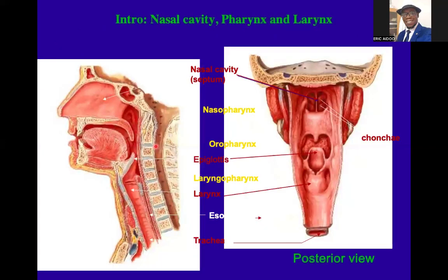As part of the introduction, we are looking at a vertical section through the head and neck, revealing the nasal cavity, pharynx, and larynx. That is the nasal cavity with the nasal septum. Air will come all the way here to the pharynx and then to the larynx. This is the epiglottis, that is the laryngeal opening. Then that is the esophagus and then the trachea.